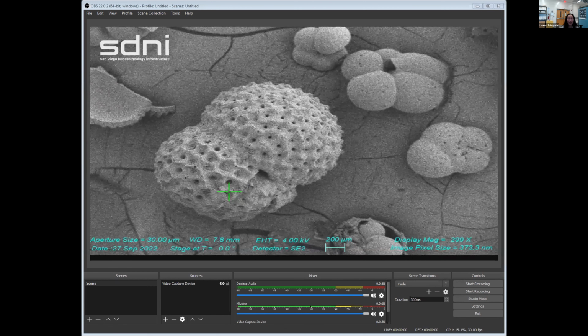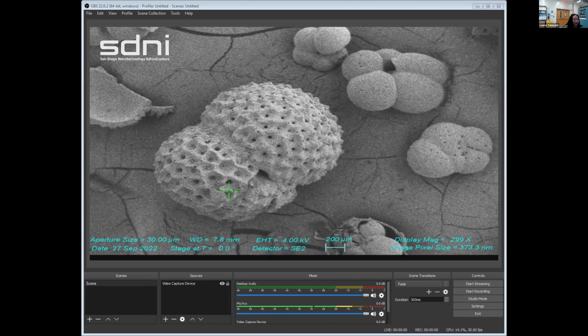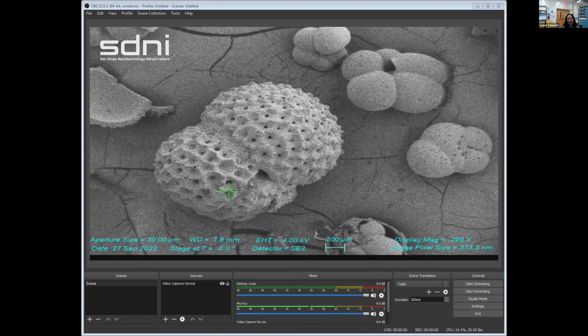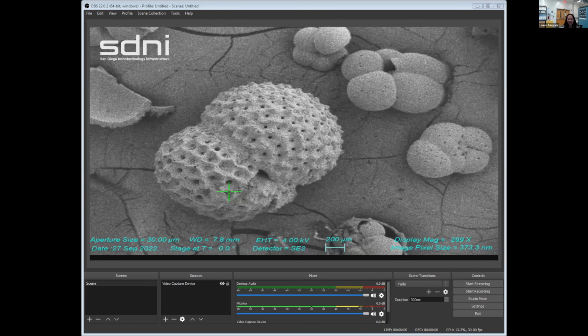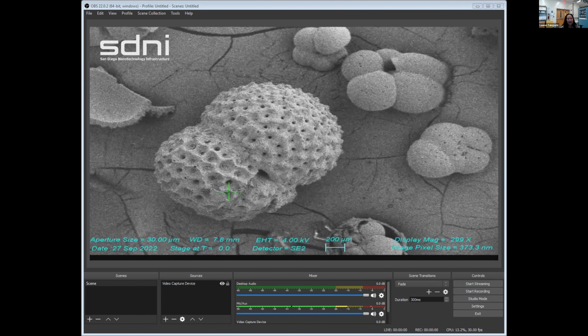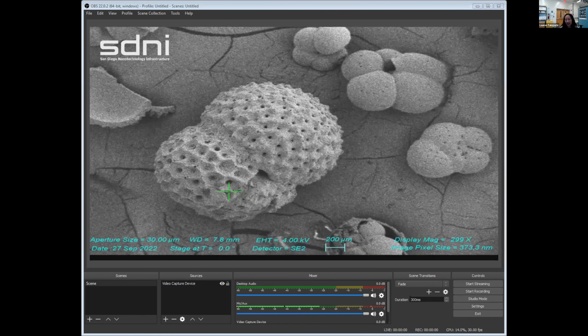But for the radiolarians, some of them have spiky textures, and this is to increase the surface area for buoyancy so that they float, because these guys can't move on their own. They kind of just drift with the currents. And the spikes also help to capture prey.